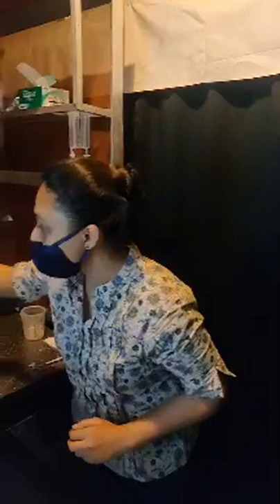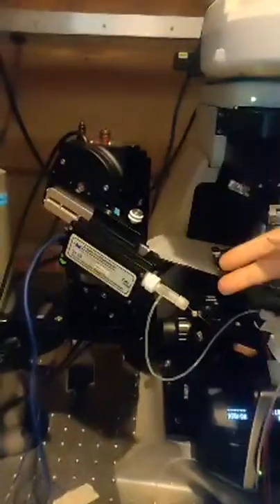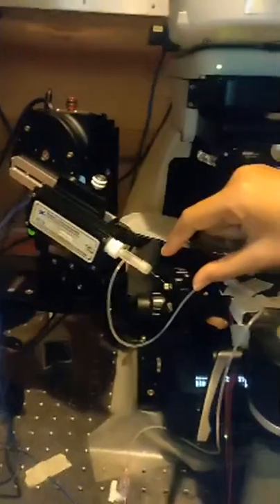Exactly. There you saw that if the fish is just moving the tail, the camera can capture it. But here we are actually recording the activity from the tail as well. Because if the prep is fixed, then we have to understand the behavior in some manner. To record those neural or electrical activities, these are the manipulators, or electrode holders.